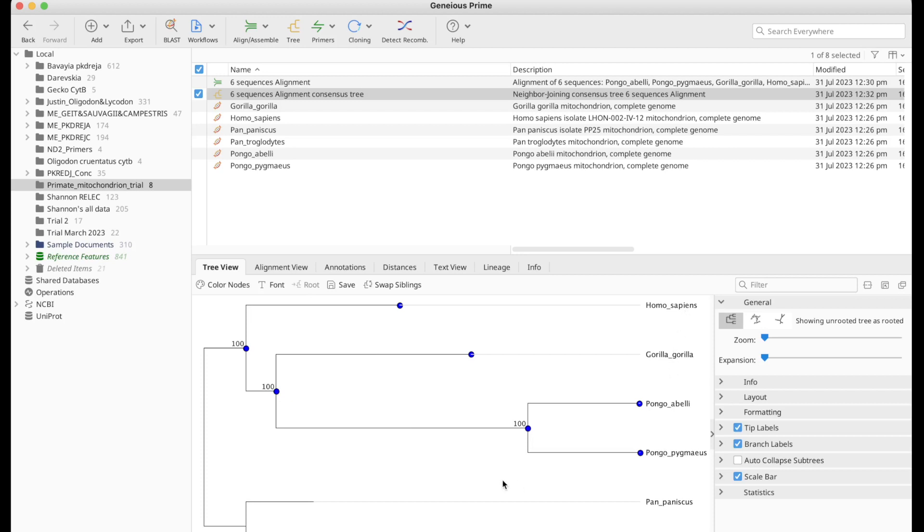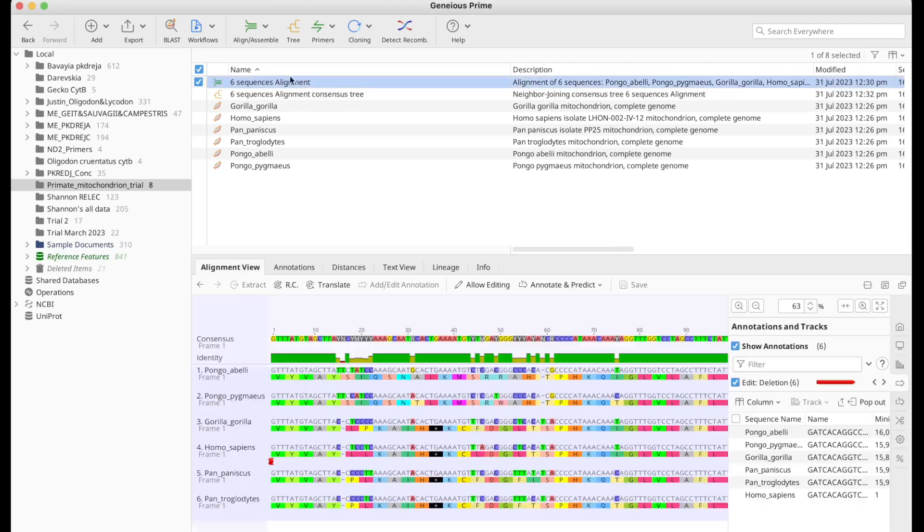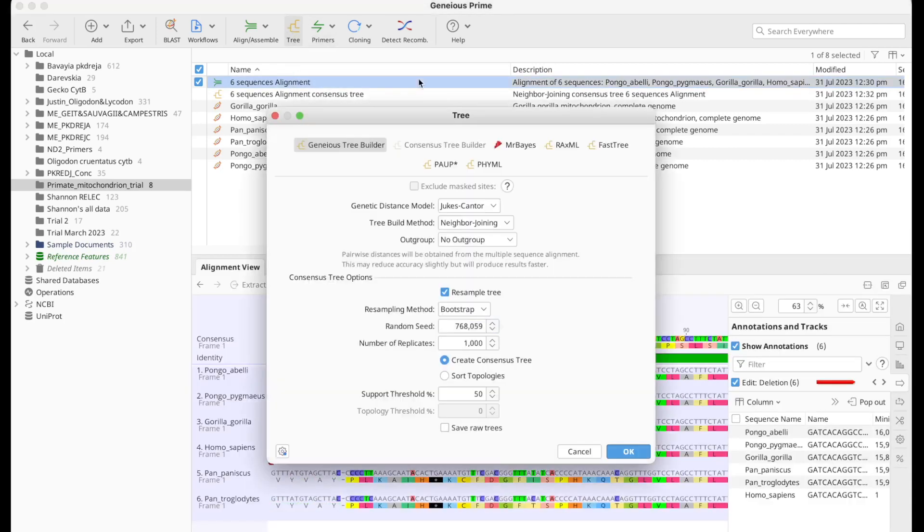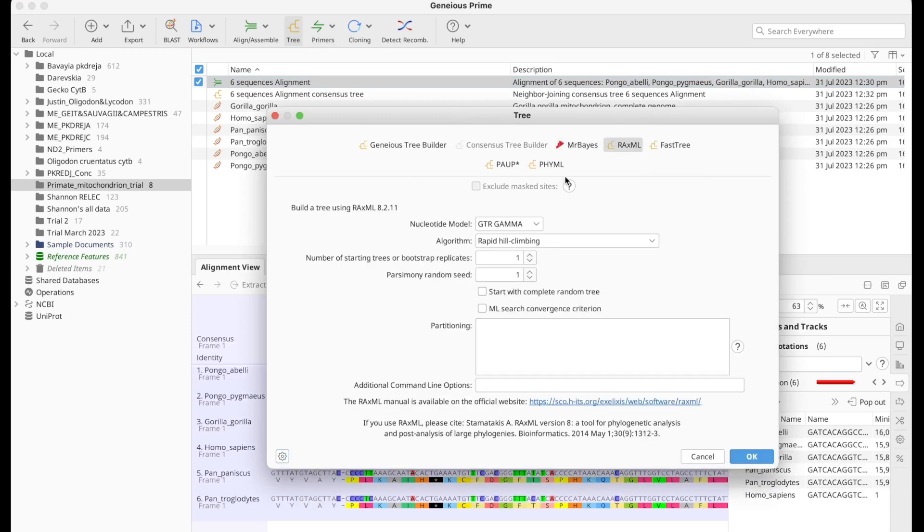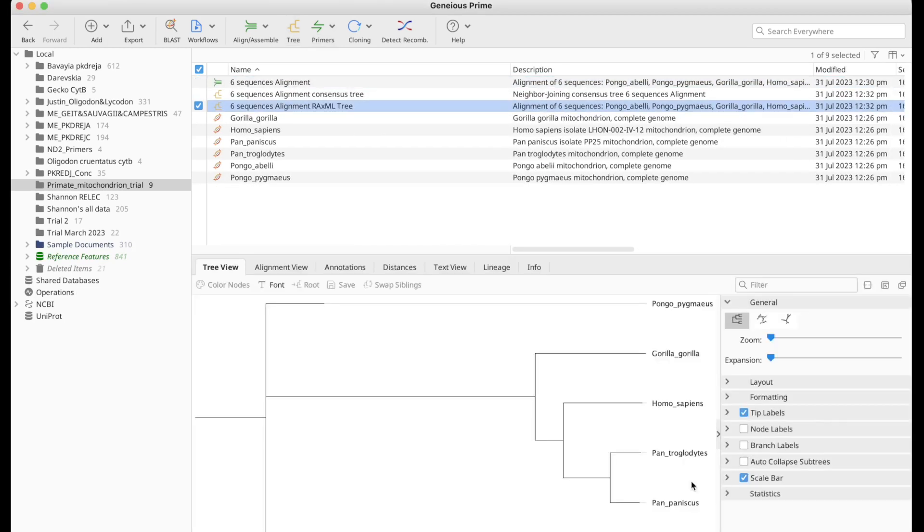Now let's go ahead and create another tree based on this sequence. Let's save this. Tree, RaxML. OK. And this is what we got.